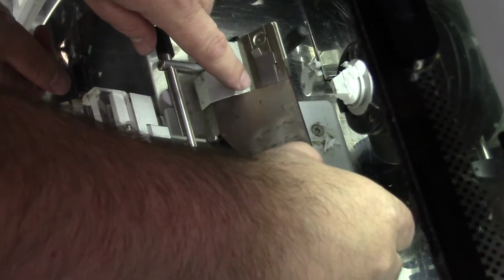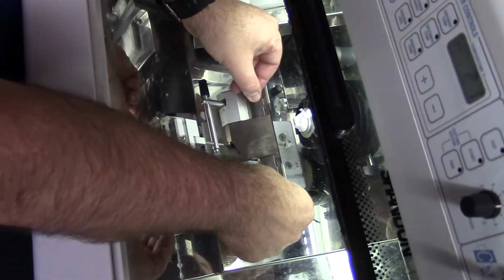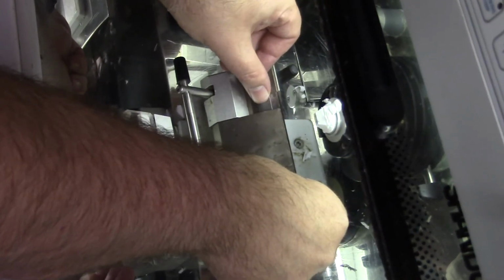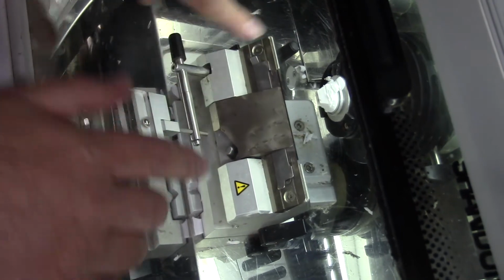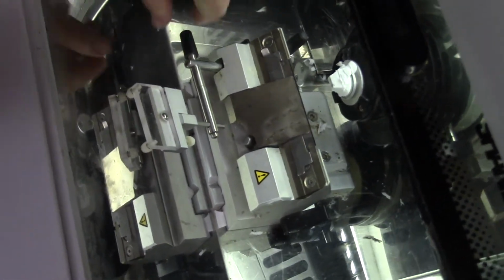So the next step will be for me to be brave and get the knife back in there. So make sure this is loose, slide the blade in, only touching the back side of the blade. It's now in the knife holder. There's the blade in there. And tighten the knife down. So now I do not want to reach in here and touch past that line.